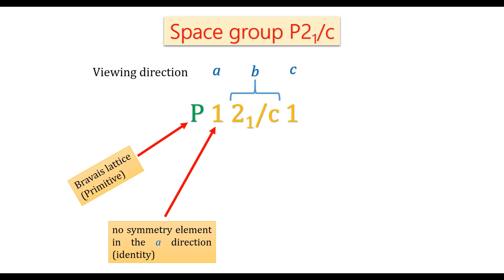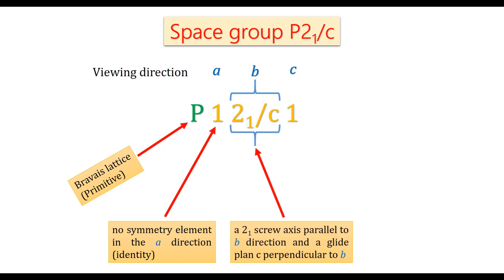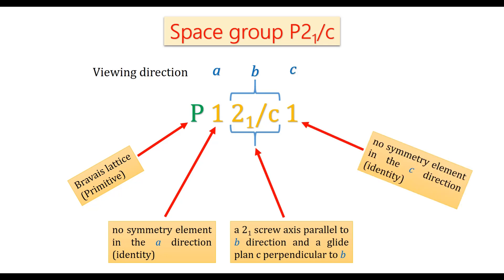In the direction of b, there are two symmetry elements: a screw axis 21 parallel to b direction and a glide plane c perpendicular to b. And in the c direction, there is no symmetry element.